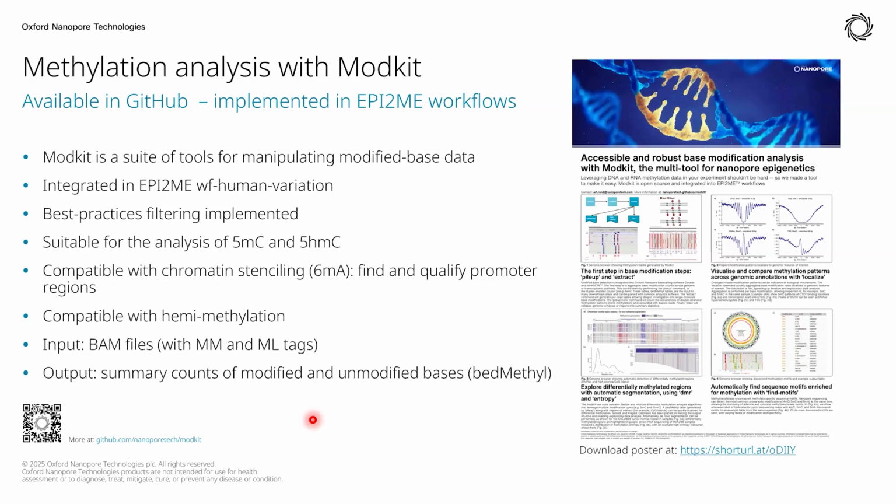But the pipeline also includes analysis for hemimethylation or chromatin stenciling workflow. It also includes what we consider to be the best practices for filtering these modified bases based on our analysis of the data. And it does include differential methylation calling.